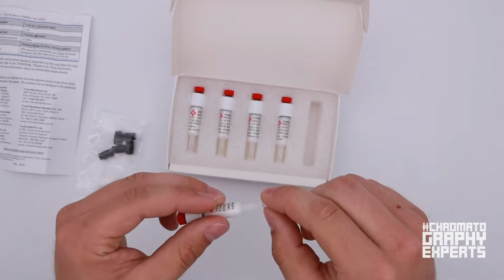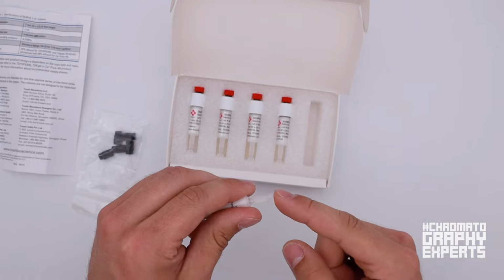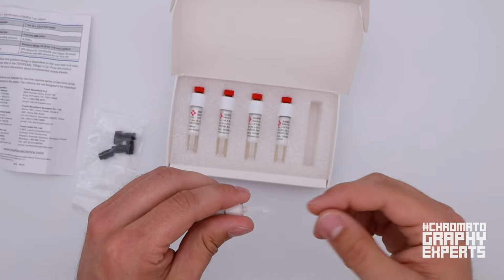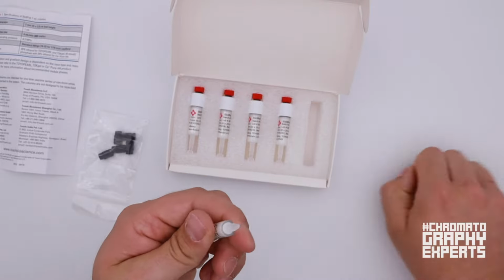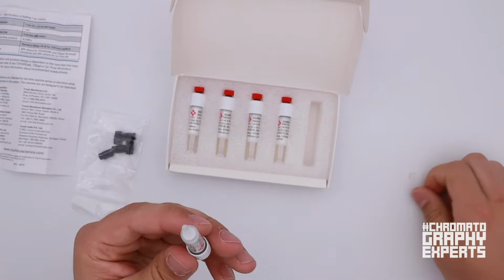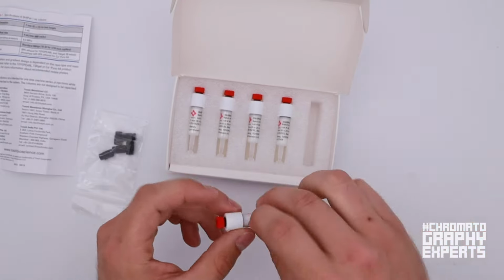And also you can see this snap-off part, and you just have to snap off this part to basically use the column for the first time. So I will just show you, just take it and basically break it off, and then the column can directly be used for your screening runs.